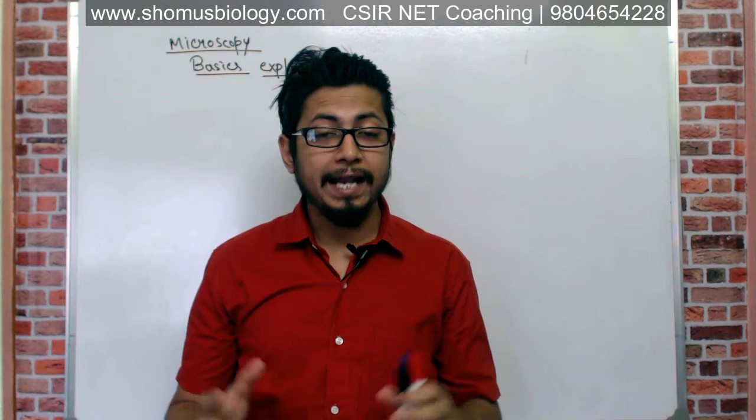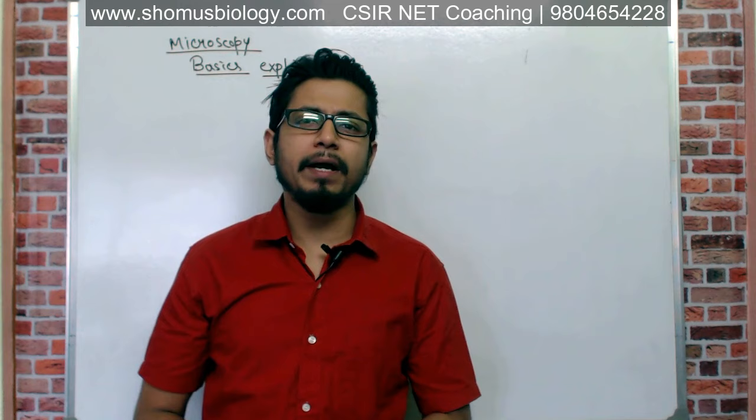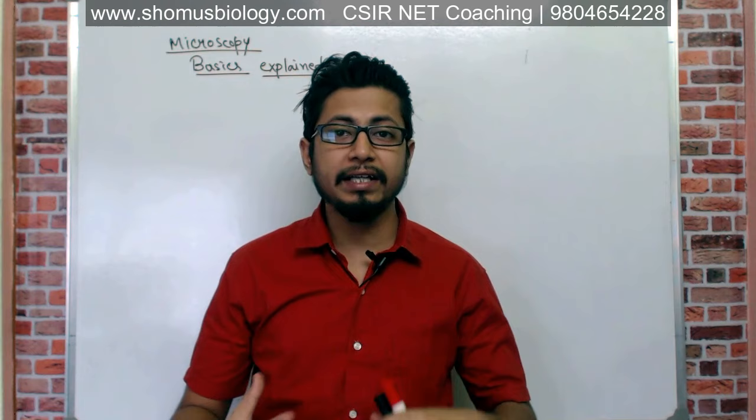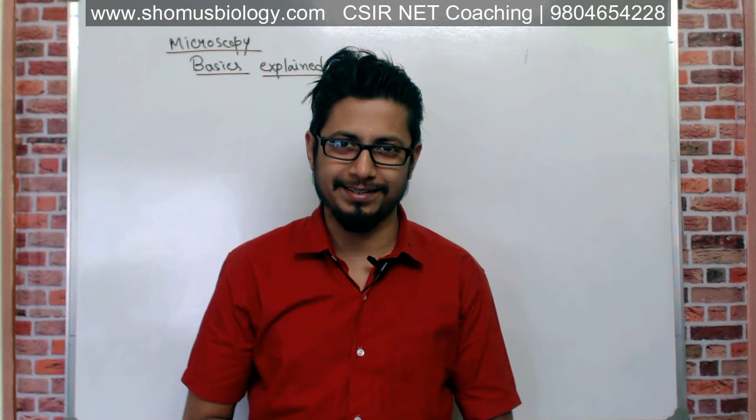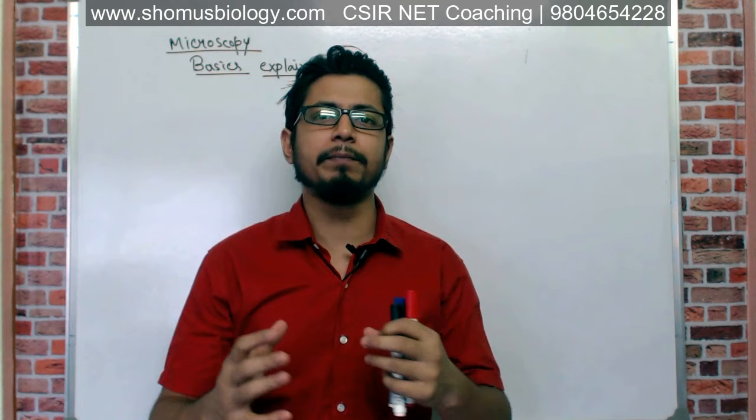And in this series of videos, we are going to talk about microscopy. I've been preparing microscopy videos for the last 7-8 years, but this time it's a series of short videos regarding the principles of microscopy, how exactly microscopy works. And we'll be seeing different types and varieties of microscopy and the processes that we use to visualize specimens. So let's begin with the very first lecture of this series, regarding the basics of light microscopy.